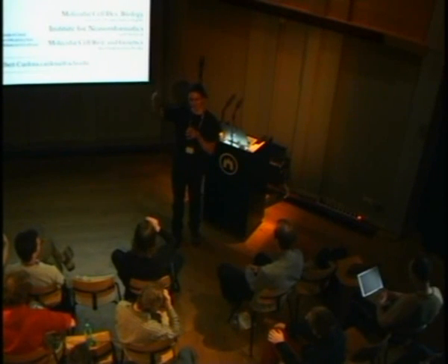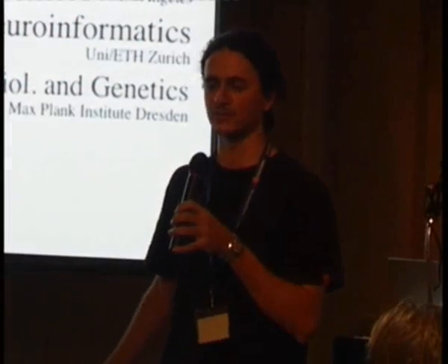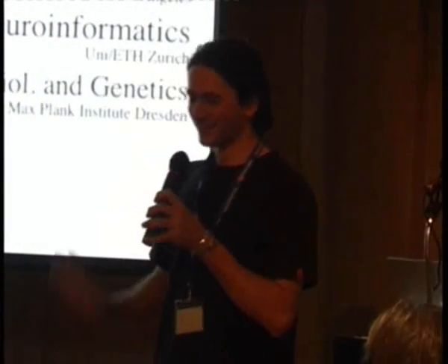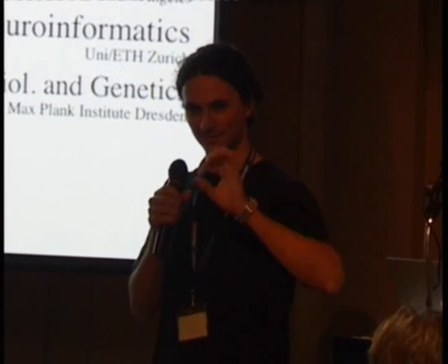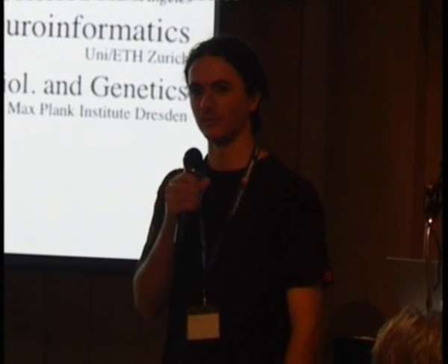So with the reflected light, you can control from which Z level in your sample you're actually acquiring images. But then I'm also working with EM. My current project is EM, electron microscopy. With electron microscopy, you can also get serial sections. This is actually real plastic embedded 60 nanometer sections. And then you can outline a model from there.